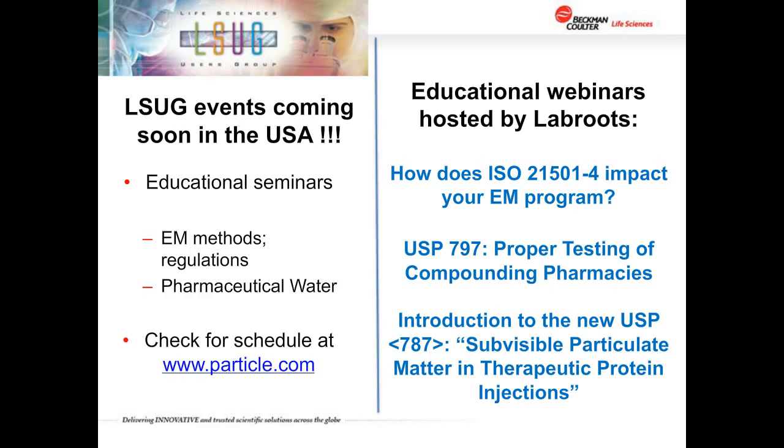Those would all be things that are critical to fulfilling a 21501-4 type calibration.